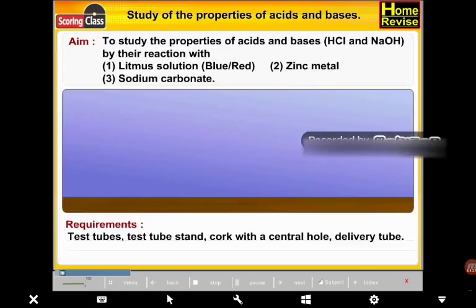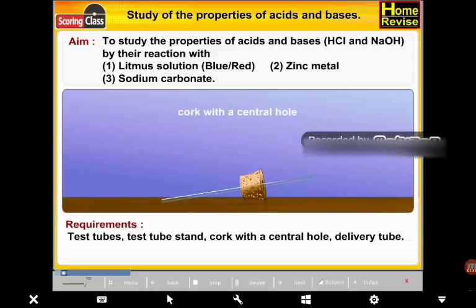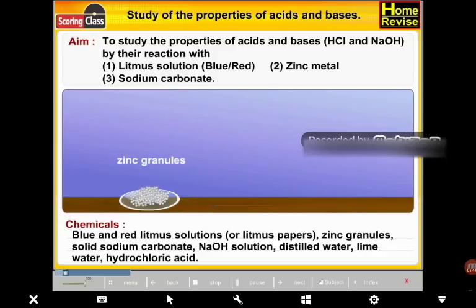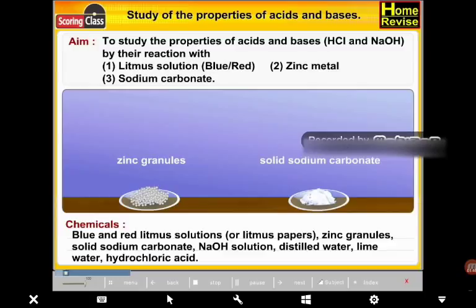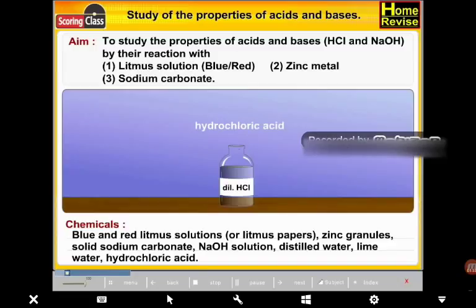Requirements: test tube, test tube stand, cork with central hole, delivery tube. Chemicals: blue and red litmus solution or litmus papers, zinc granules, solid sodium carbonate, NaOH solution, distilled water, lime water, and hydrochloric acid.